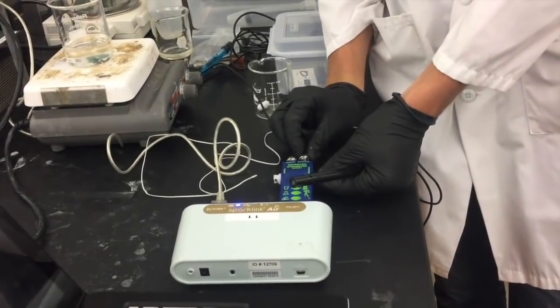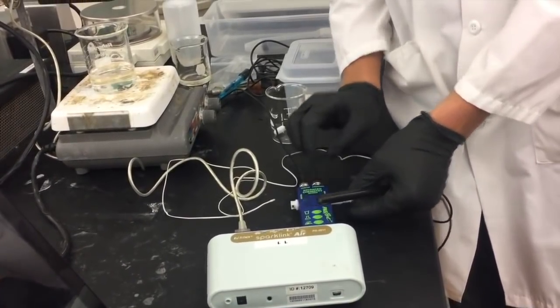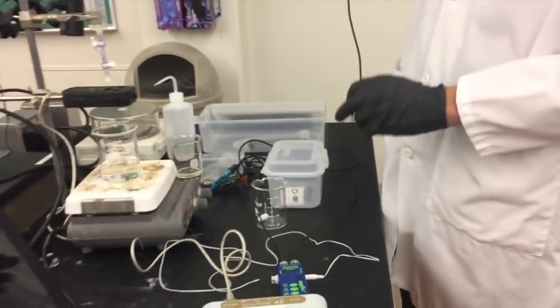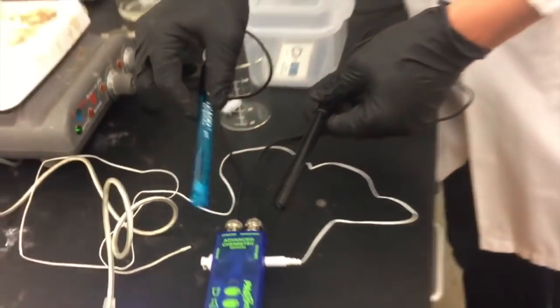Finally you'll need the conductivity meter that should be soaking. You'll also plug this into the advanced chemistry sensor. Make sure you double check that the pH meter and the conductivity meters are attached to the correct ports and they haven't been switched on accident.